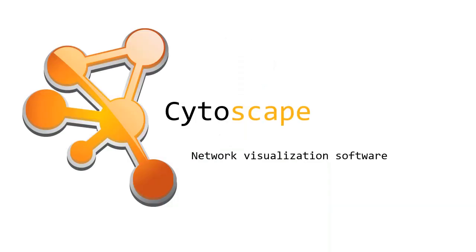Hi, so today I'm going to present Cytoscape, a network visualization software which is going to be useful for building protein-protein interaction networks or gene networks.